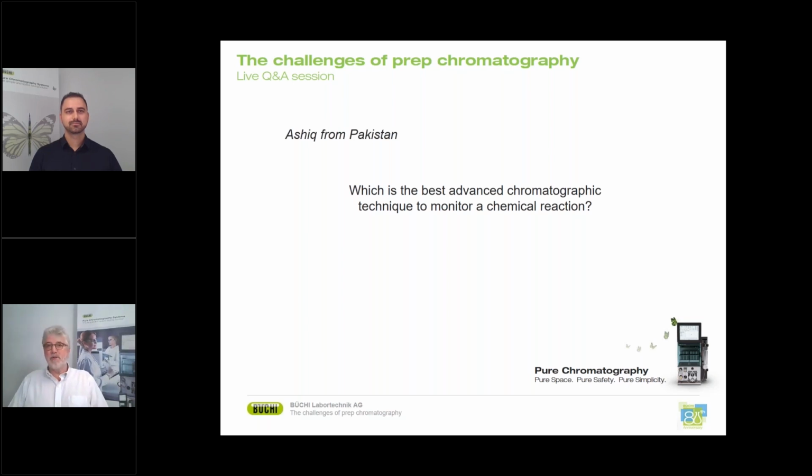You need skilled people to use these instruments, and in many cases the organic chemists or the people doing the synthesis are often not skilled chromatographists, so that might be a bit problematic to handle the units, to make an interpretation of the results and so on. And for sure, it will be much more expensive. So it depends on what the customer really wants, but again, I think most people are using TLC, which is not really advanced, but very cheap and very fast.